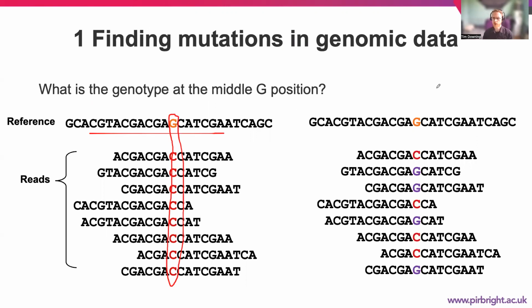If we're looking at the reference on the right here, we may have instances where for eukaryotes, we've actually got a heterozygous site. That's a CG allele. The reference is a G. But then for viruses, we may have low frequency variants as well, where we have mutations within the collection of virus particles that we've sequenced.